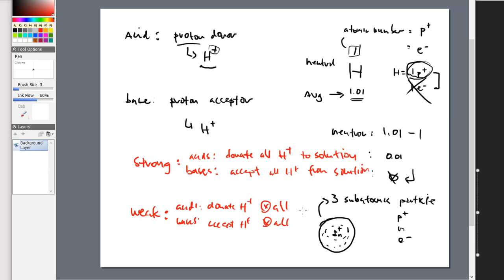In a general chemistry class, you might be presented with something a little bit different. You might be given extra definitions for an acid and base. You might be explained strong and weak acids or bases in a slightly different way. But for us right now, this is all that we need to know in order to go through this very first lab experiment together concerning pH.